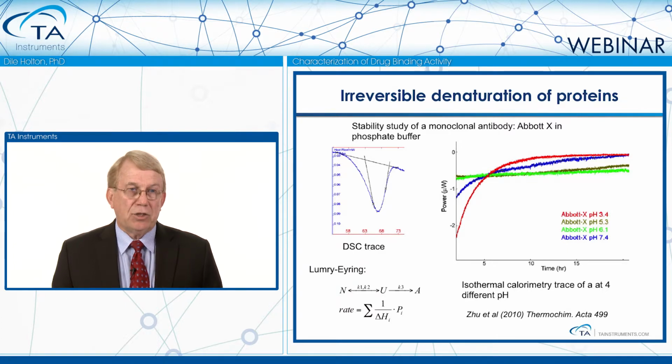And in this particular case, you'll notice it's between 5 and 15 hours. So we're not talking a week, we're not talking a month, we're talking just a few hours to be able to get an idea if something's happening in the sample.